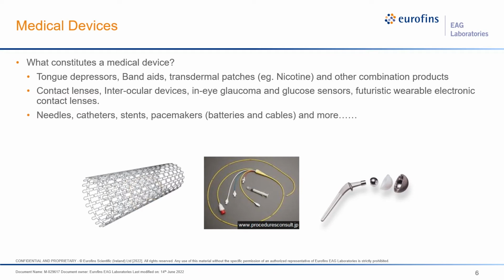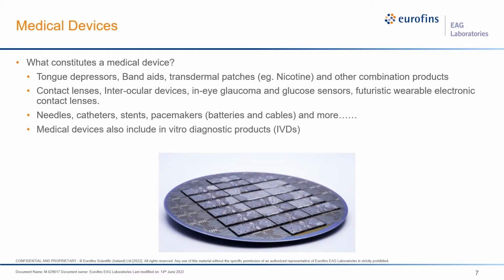More invasive devices such as needles, catheters, stents, valves, pacemakers with all the batteries and cables that go with it also constitute medical devices. In vitro diagnostic products such as lab on a chip also constitute medical devices since they come in contact with body fluids. Chemistries at the small reaction sites on these semiconductors or glass structures is extremely critical and need extensive surface and interface analysis.